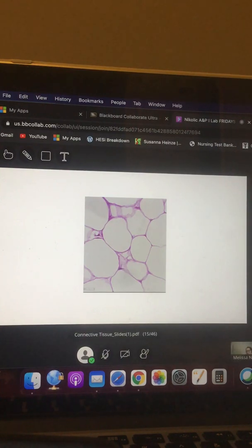So an example here, which is kind of similar to what we saw there. Here's another example for nucleus that's similar to the book, only inversed. It's kind of like upside down. All right, awesome.